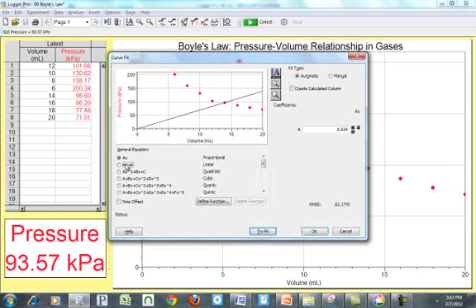It gives me a line that doesn't make any sense. mx plus b is actually the linear fit. That's not a good fit. So I'm just going to go down this list and keep looking for relationships or equations that work pretty well. Now that one's much better than the other, so I might want to write that down. It says to write 6 down.